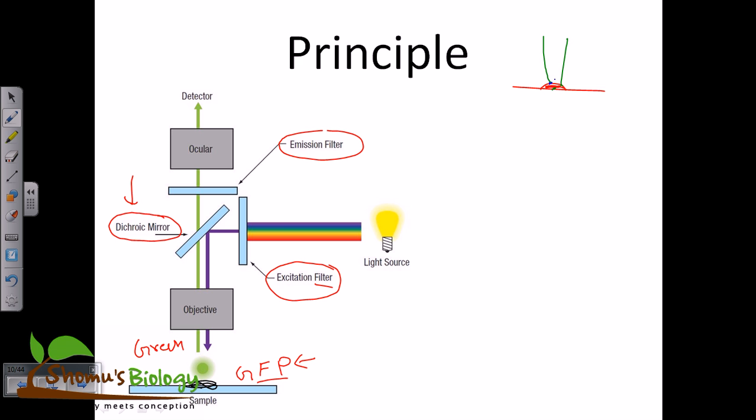According to our idea, if the lights come straight like this, it will be very good for the camera or detector to detect. But in reality, we'll see scattering like this. These are different kinds of scattering of light, and most of the energy of this fluorescence light is lost during scattering or radiation of heat. So to prevent that, and to collect all these lights together and arrange them, an emission filter is required. An emission filter will allow only this particular wavelength of green light to pass.